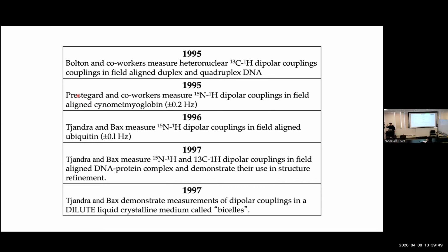Now, the dipole coupling will also scale quadratically with B squared, but the CSA, the residual chemical shift anisotropy, the other anisotropic part of the chemical shift, will scale with B to the power 3. And it's one of my favorites. If you ever want to convince somebody to buy a high-field magnet, the best argument is to measure residual chemical shift anisotropies in the nucleic acids, because it actually grows as B to the power 3.